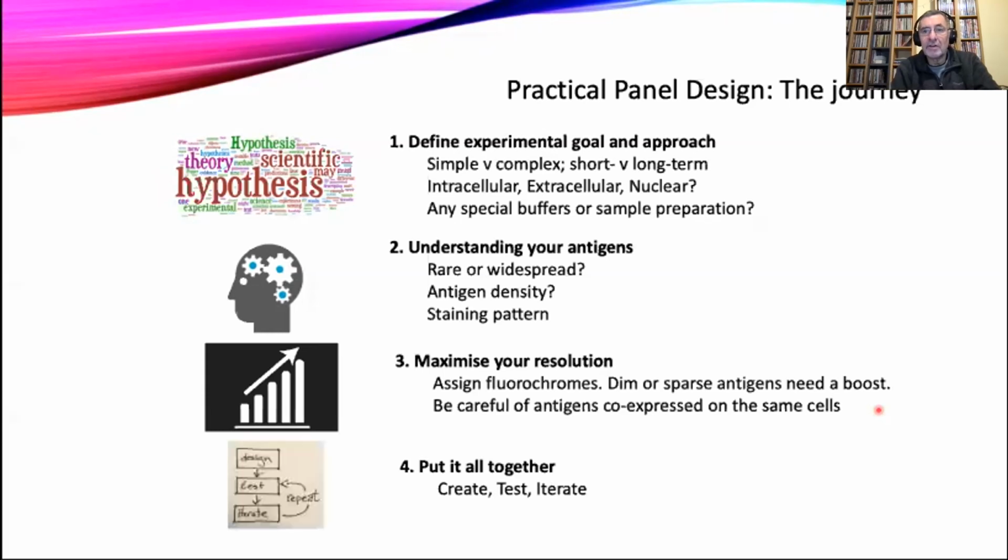And this isn't necessarily an easy or a quick process. And the more complex your experiment, the longer it takes. You may come up with what you think is a reasonable experiment on paper, but then you have to go to the cytometer, test it. If it doesn't work, we come back and we start again as an iteration. And it can take a long time.